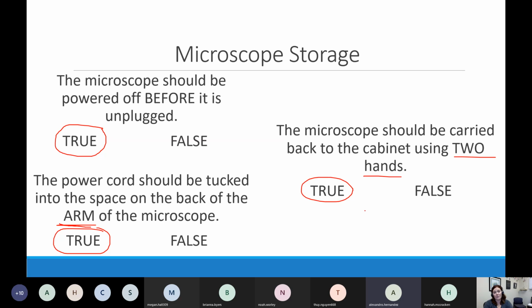We'll get really good at moving microscopes. We're going to be using microscopes almost every week this semester, starting next week. So lots of microscope work coming at you soon. We'll get really good at storing them, and we'll get really good at figuring out who doesn't know how to store microscopes, because what's going on with this one? The stage is all the way up, the scanning objective isn't in place. So we'll get really good at calling other people on their storage woes too, right? It's only good if you can call other people on it too.